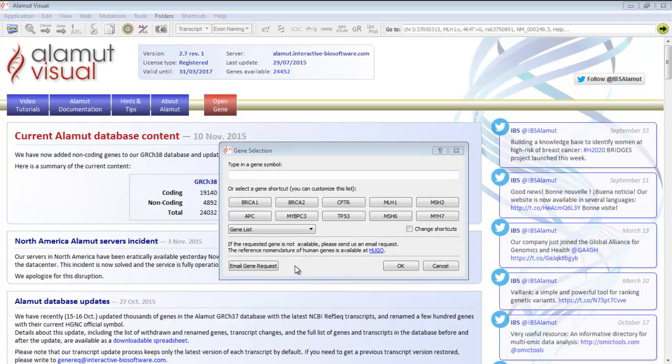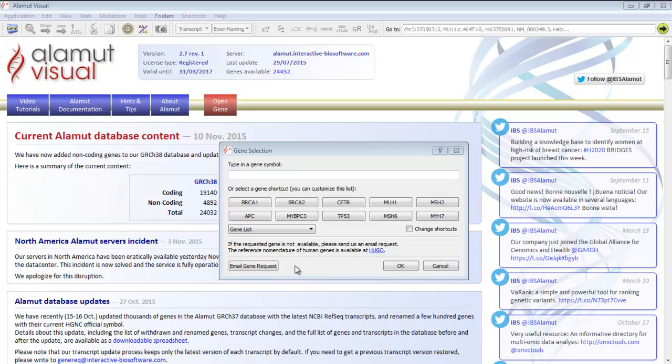When you launch Alamut Visual, you need to select the gene you want to work on. If the gene wanted is not available in the Alamut Visual database, you can email us a gene request with this button. You can customize the shortcuts list with the genes you usually work with.